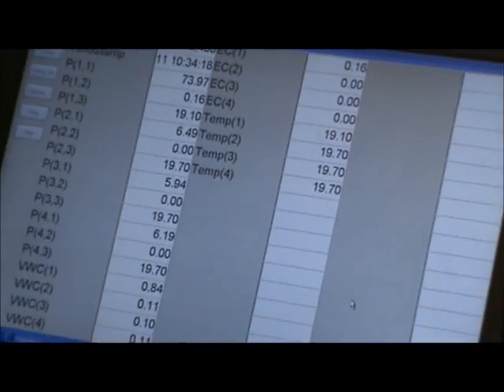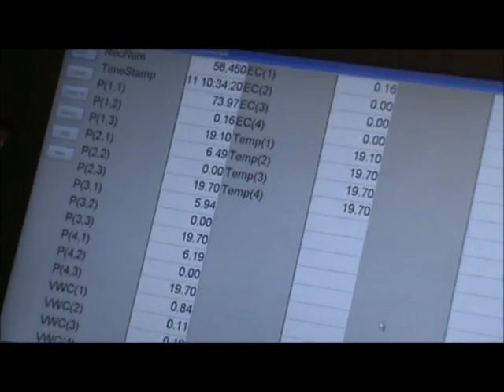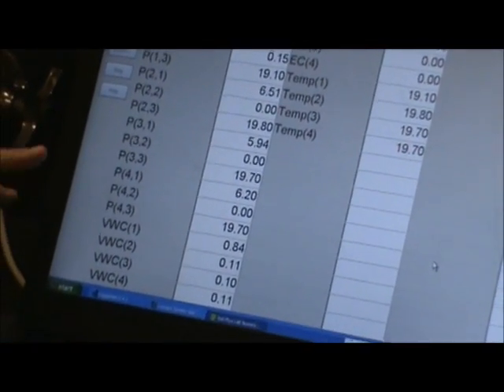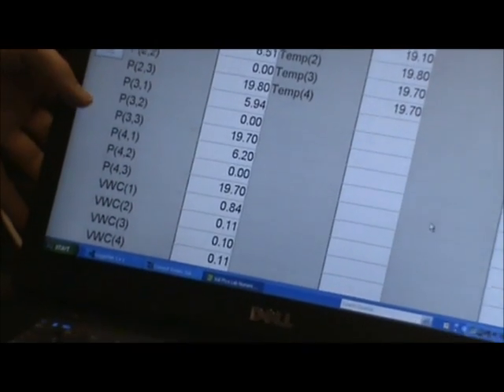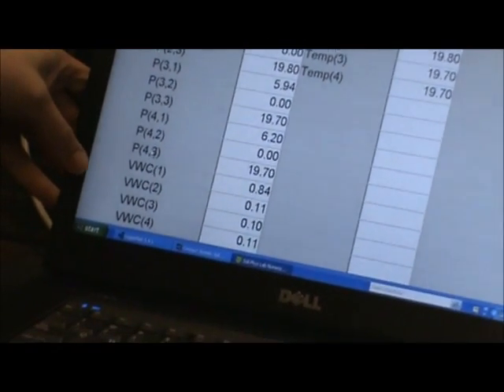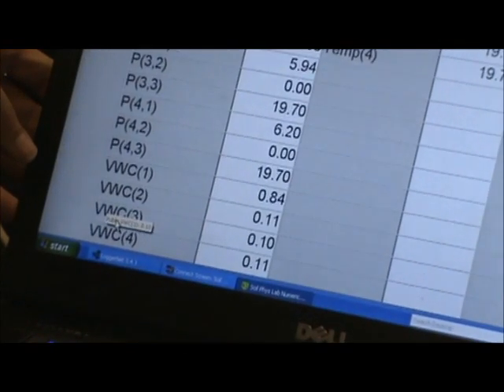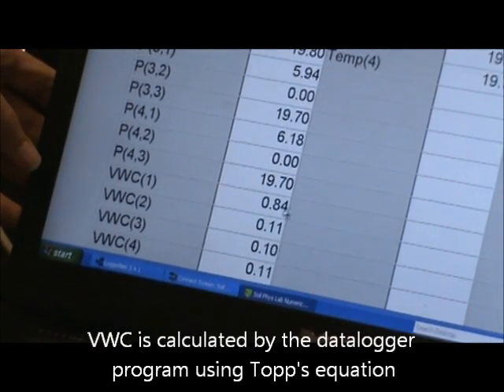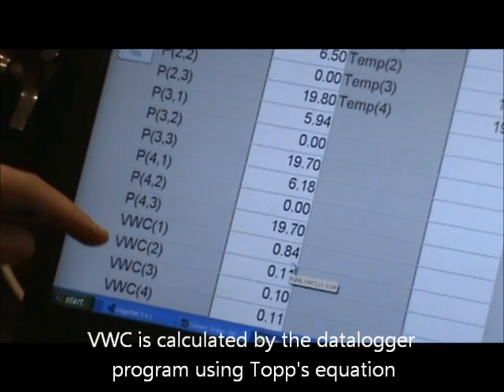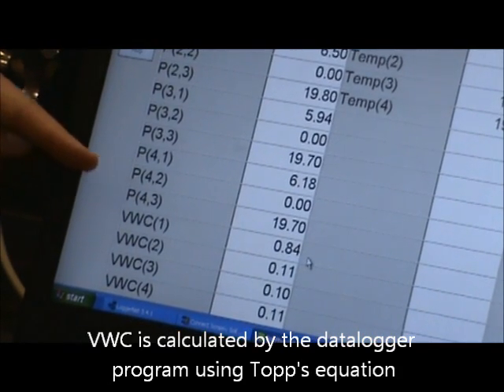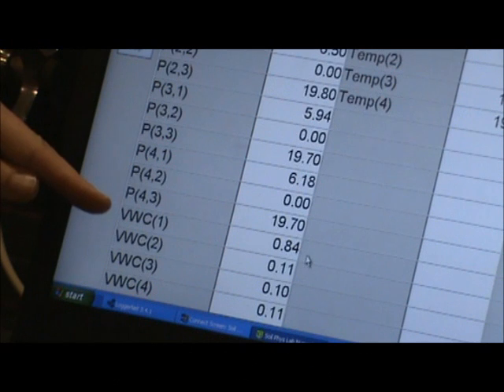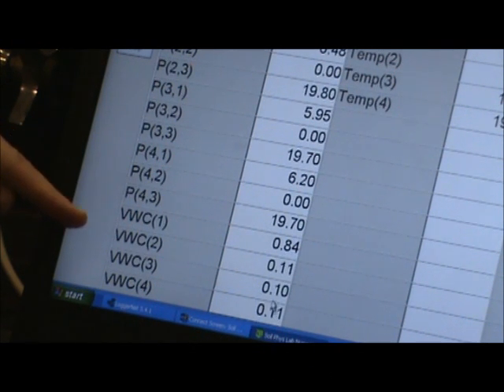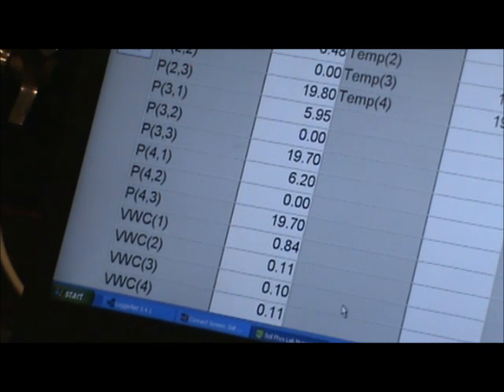And here we just have it all done for us. We don't have to go through and find the wavelength or anything. We have the pressure readings and then the volumetric water content calculated here for us. So this one here, the 0.84 volumetric water content, that is the capacitance probe that is in water. These three here are the ones that are sitting at the surface of the sand and water in the bucket.